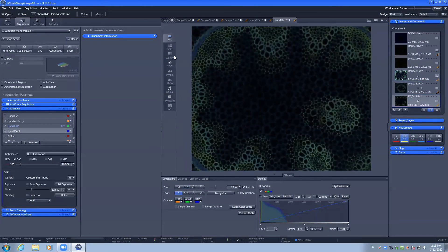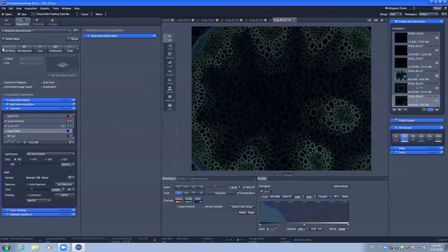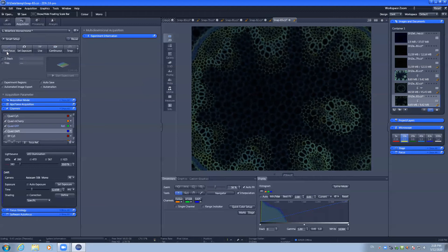From this snap using the set exposure and fine focus, you can then tweak the settings for more reproducible captures.